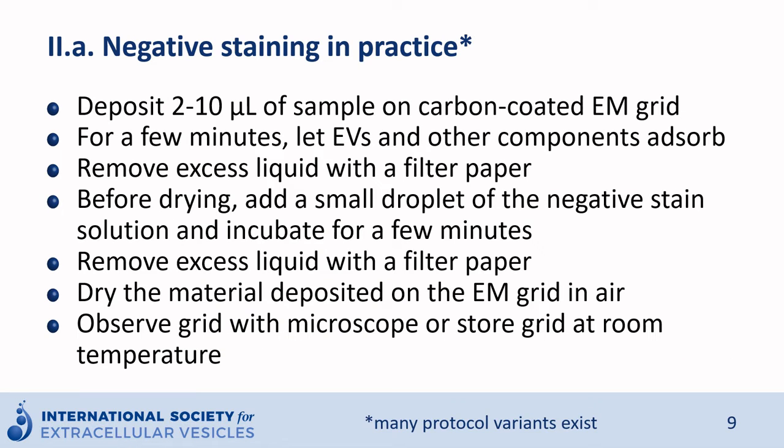In practice, let's deposit a small volume, 2 to 10 microliters of sample, on a carbon-coated EM grid. For a few minutes, let EVs and other components adsorb on the carbon film. Remove the excess liquid with a filter paper, and before drying, add a small droplet of the negative stain solution and incubate for a few more minutes.